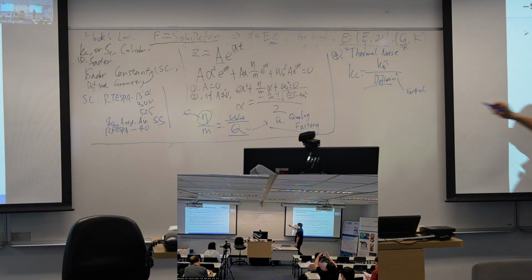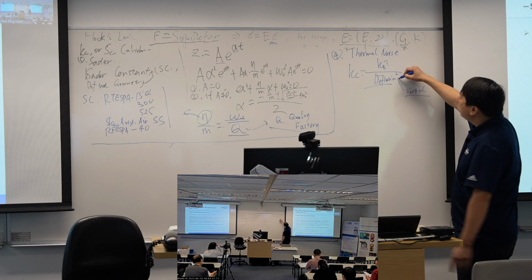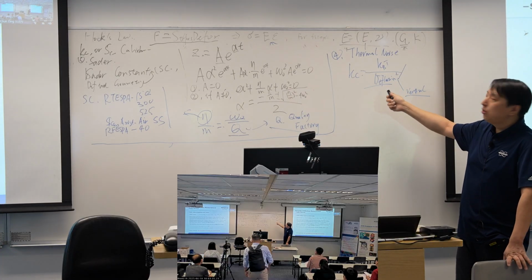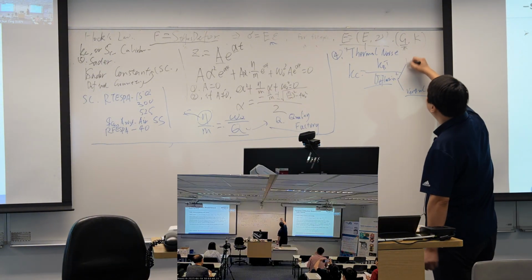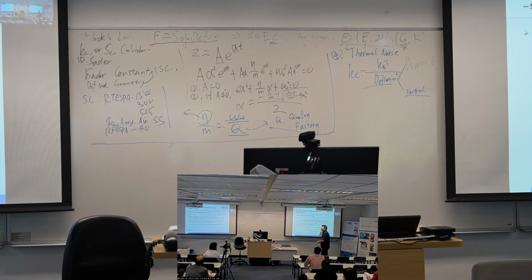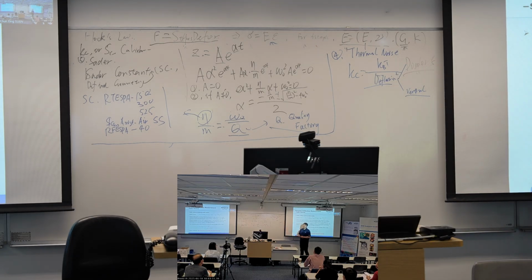But this is not the only way to measure the deflection. We have many other approaches. Nowadays in the industry, they use other machines to measure the deflection change, and once you get the deflection change, then you can get the Kc out. Some people use the Doppler effect to measure the deflection change, and this method has been widely used in industry.